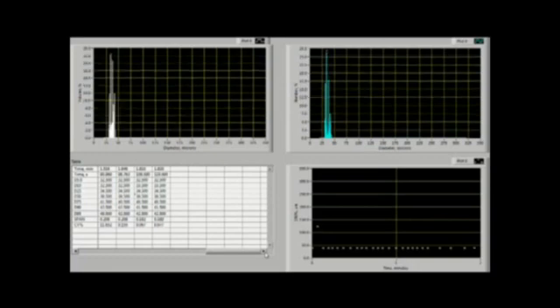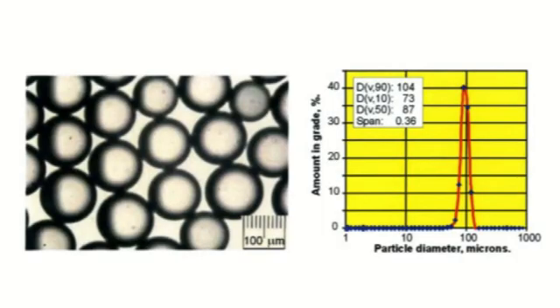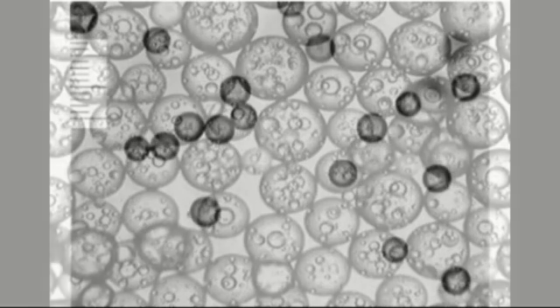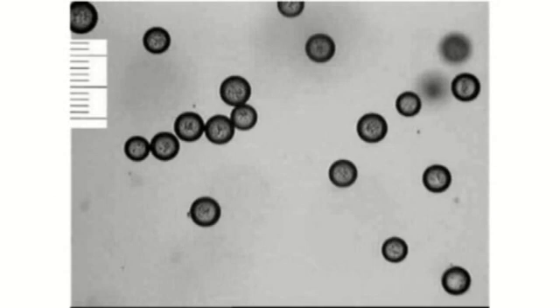So that's a fairly tight distribution. Here is an example taken under the microscope. This one here is a little bit higher. And here we have double emulsions. It's a gentle system, so it's easily possible to generate double emulsions. That was PLGA. This is polystyrene or styrene droplets formed in the system.